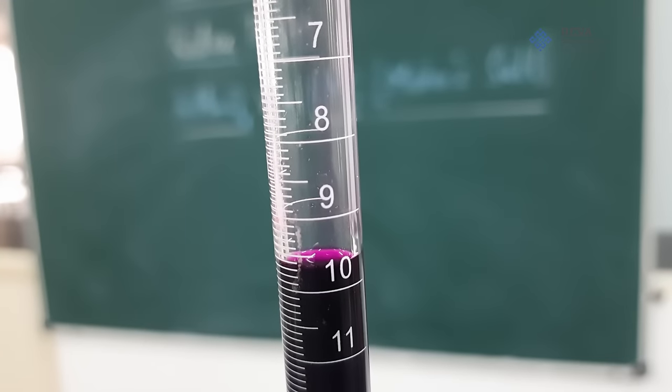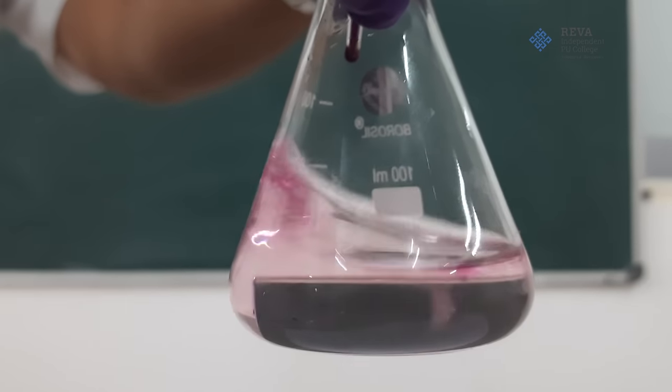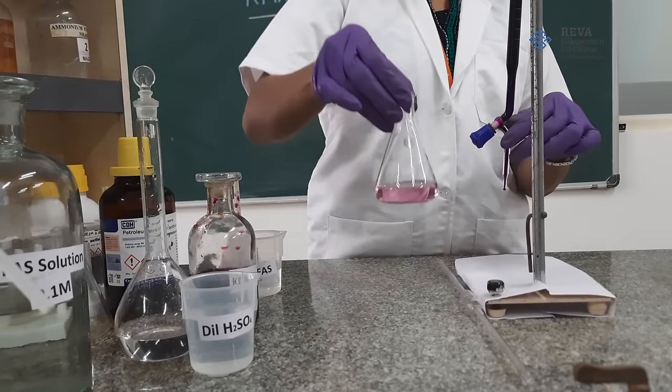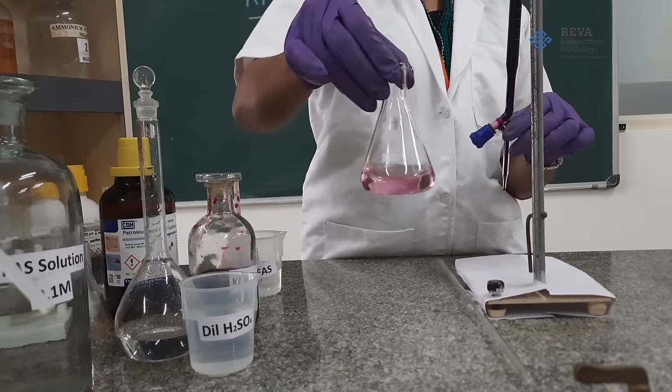As it is reaching an end point, we can see a local pink color which disappears slowly. When the solution in conical flask turns permanent pale pink color stop the titration.